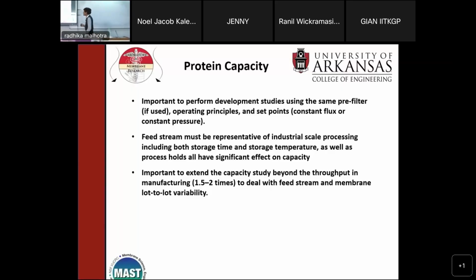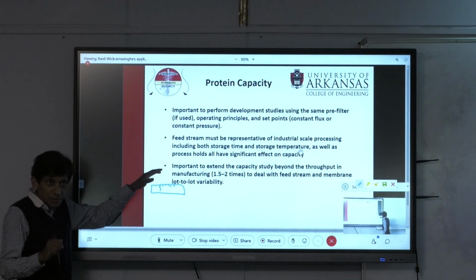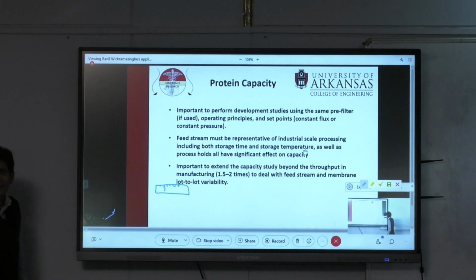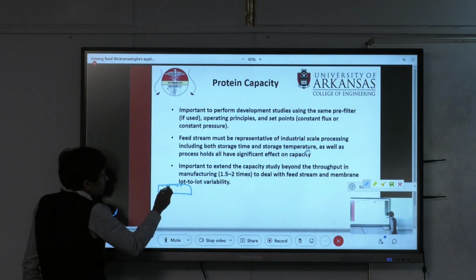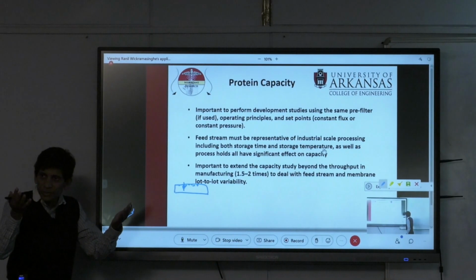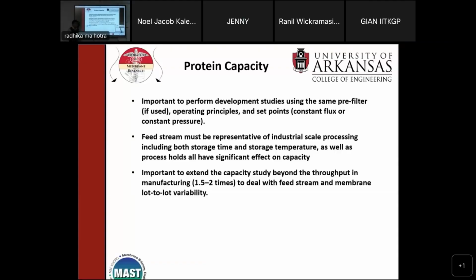The problem is this: it has been shown that if you have a normal flow filter like this, and you look at the structure, the virus particles are trapped here in pores. When you switch to a buffer, you have to stop and release the pressure. This is running at, typically, maybe 1 atmosphere, the maximum maybe 3 atmospheres. It's not very high pressure. As soon as you release the pressure, the viruses trapped in pores can actually back diffuse. There's a possibility for Brownian back diffusion, and then they can find other pores that may be more open and they might get through, okay?